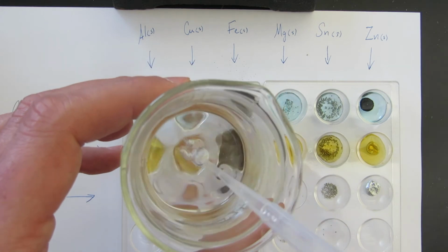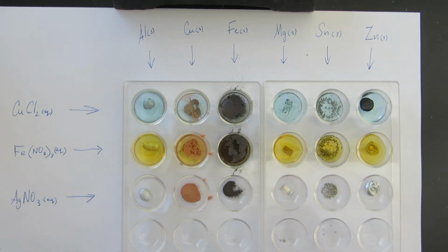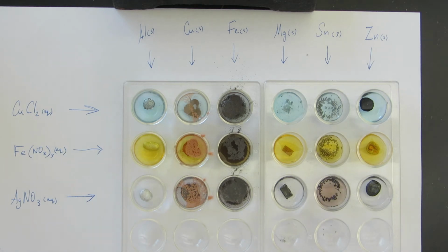You can see just pretty much looks like water. Magnesium's reacting pretty fast. Tin as well.